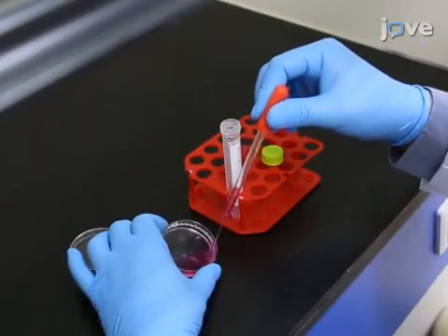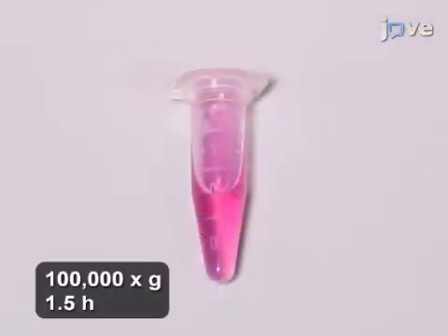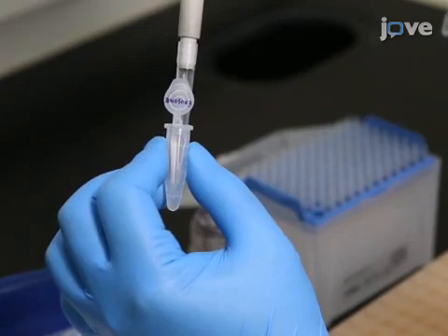Using standard techniques, prepare exosomes in culture. Then ultracentrifuge the culture supernatant of HCT116 cells to pellet the exosomes from the media. Once pelleted, carefully remove the culture supernatant.